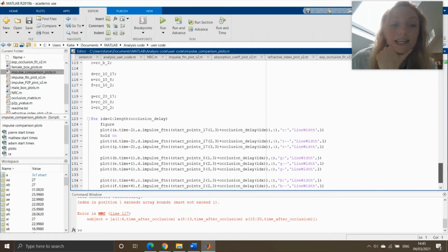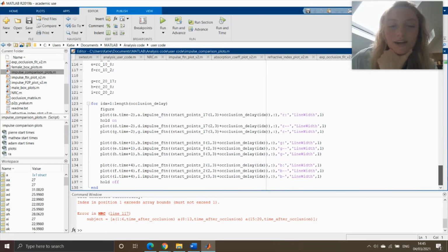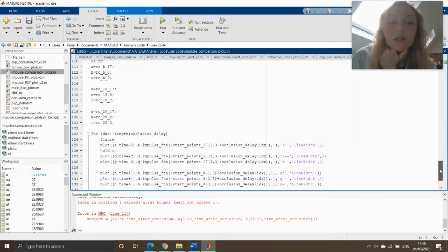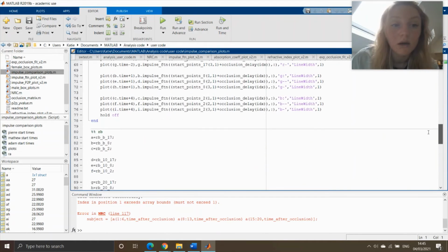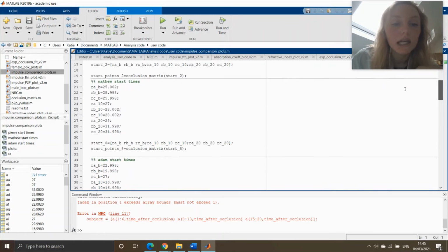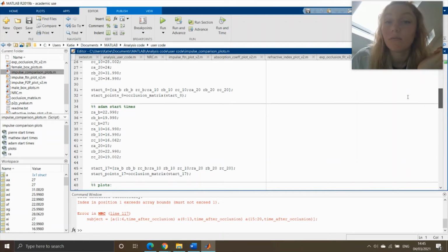and it's allowing me to carry out comparisons of those values across participants. And I'm doing this, in fact, for the same participant for 3 different points throughout occlusion, and for 3 different participants, to compare how the impulse function varies both for application of product and time of that product being on the skin, so the hydration, but also how that changes for different participants. So for this one, we were looking at participants of different skin tones. So what I've done here is I've loaded in 3 participants of really different skin tones.